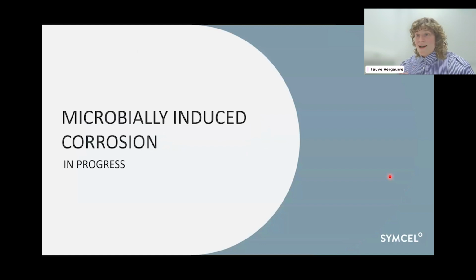These results already highlight the potential of this assay across diverse applications. And I already explained to you a bit what type of applications might be interesting, but one I would like to highlight a bit is one that Stephen also touched upon already, this microbially induced corrosion. So when the corrosion of materials is accelerated by the microorganism.